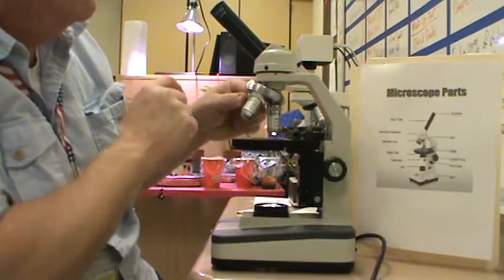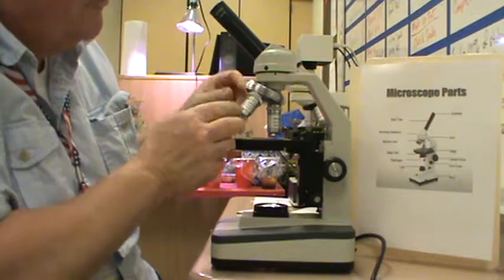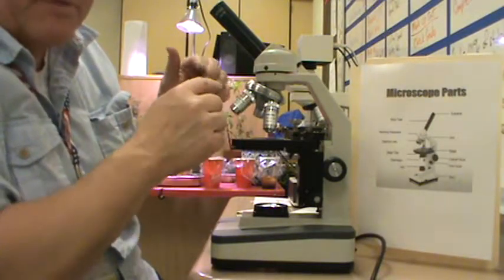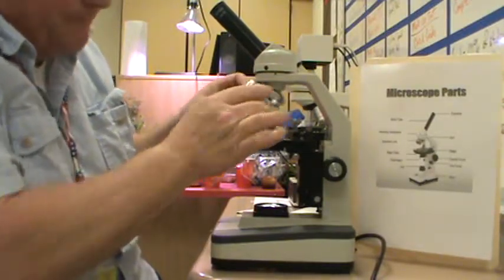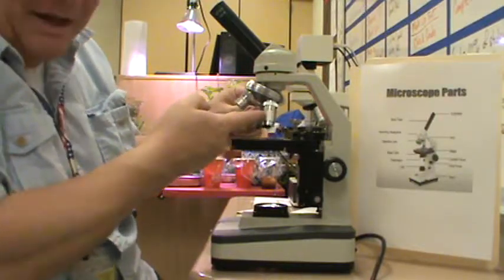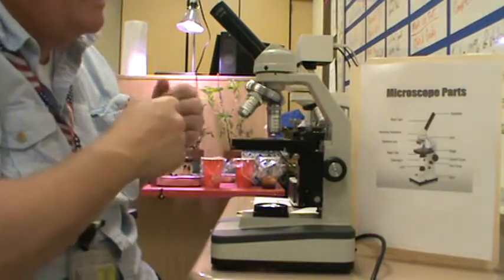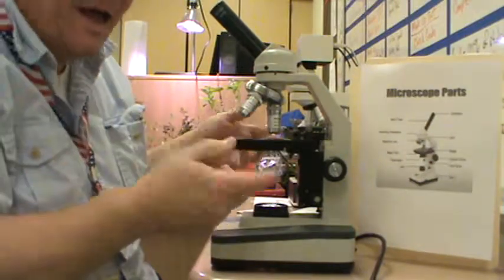The medium vision one here is 10 times 10, and on this particular microscope that would be 100. And then for the high power, this is 10 times 40, so that gives me a total viewing of up to 400 magnification. And in microscopes, there are usually 3: low power, medium power, high power. Nothing too fancy here. I do have a few microscopes that have 4 lenses. I told the students low power, medium power, high power, and then highest power.